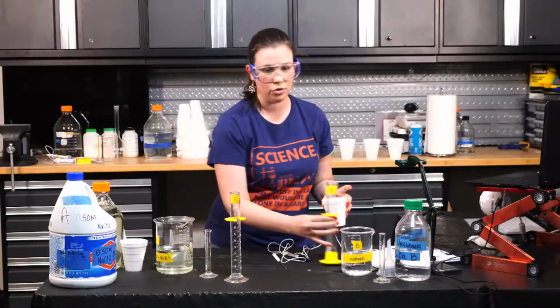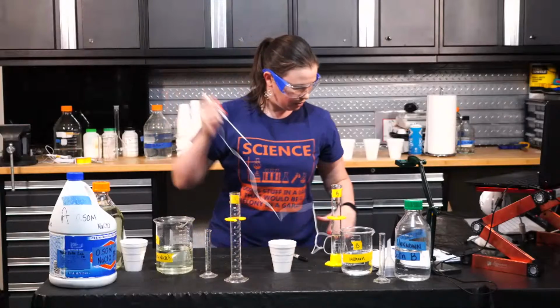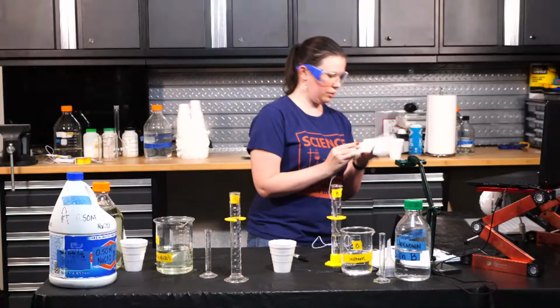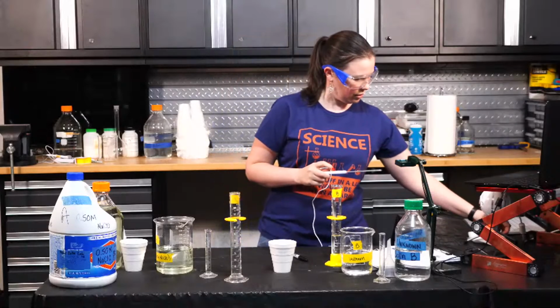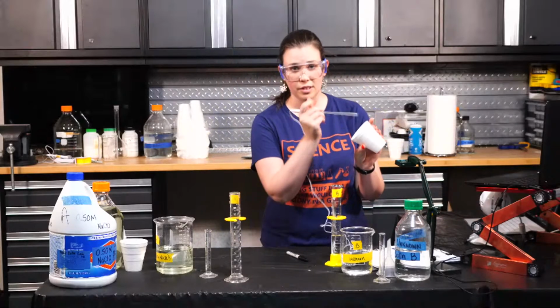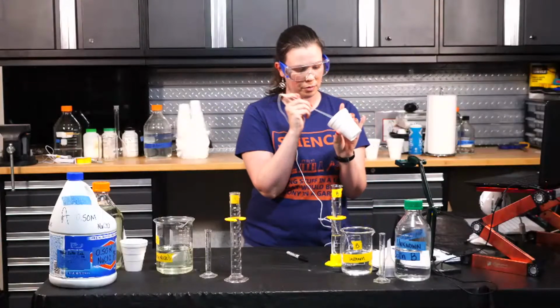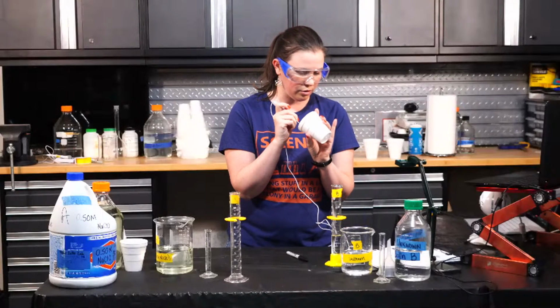Oh, wow. Sorry. Almost did a bad thing. Didn't mix yet. So let me get my initial temperature, clear this off, make sure there's nothing on it. And there's not a whole lot to dip it in. So I'm going to try to gather it off to the side, kind of tilt it, so that way there's enough to submerge the probe of the thermometer. And so we can get our initial temperature here.